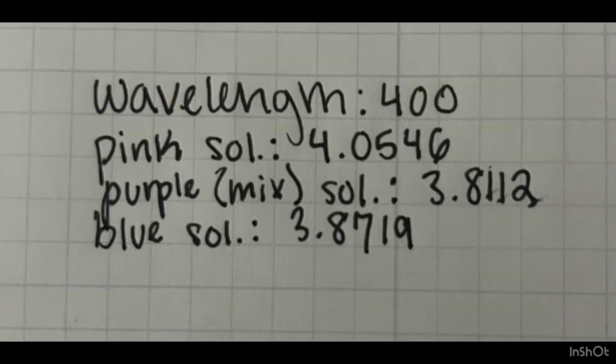While showing a picture of our notebook with all of the absorbance values we gathered, I'm going to explain why we zeroed the machine with a blank or water. We use zero to account for background or previous absorbance from other groups, so you'll have accurate measurements.